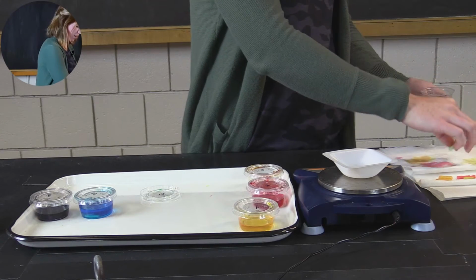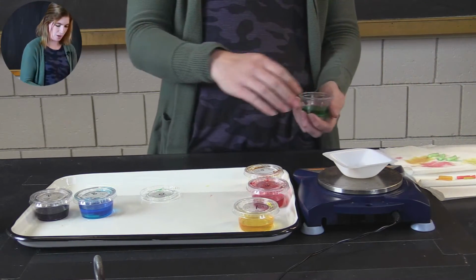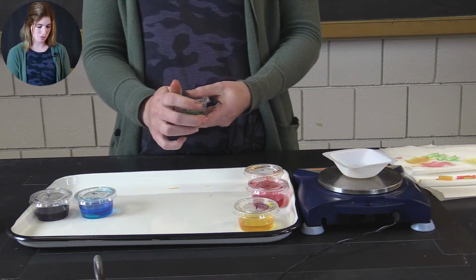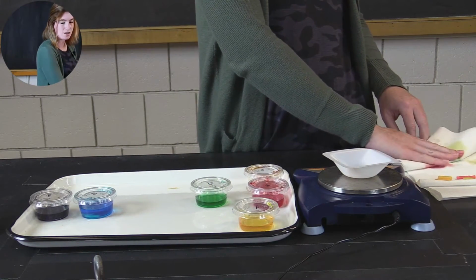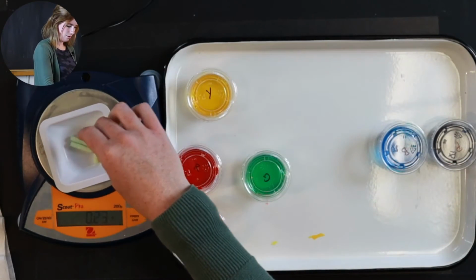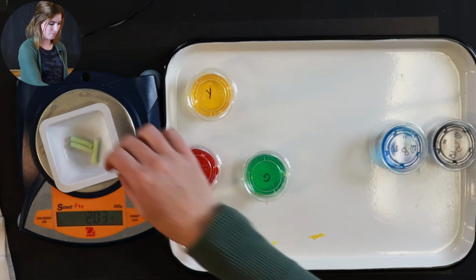Next I have my green, and I'm making another observation here for you guys. My green ones look as though they have maybe gotten bigger over the night. And so I would like you to also think about, does that mean that water might have moved in or out of my potato cells? So my green final mass is 2.03 grams.